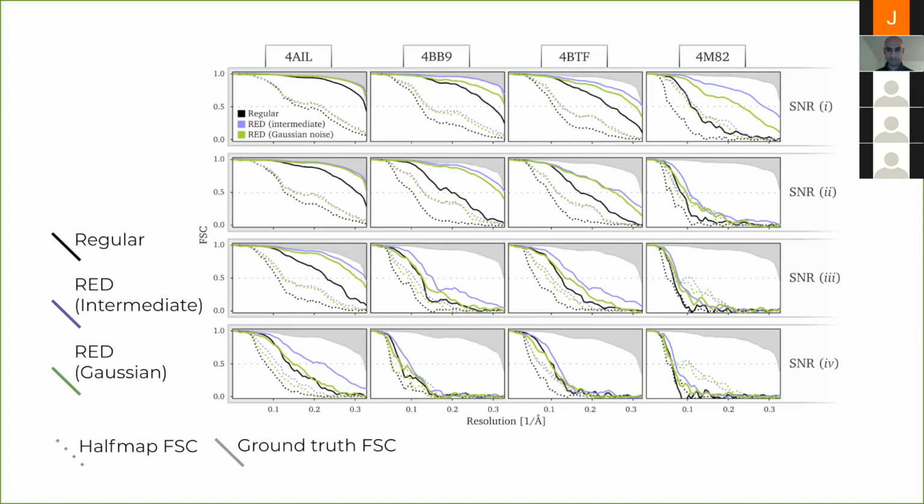I'm wondering if using something along the lines of the density histograms or the connectivity, translating those to the EM density, is something that has been investigated in EM and you folks decided it was better to just go with a neural network? Or, can you comment on why you go with one approach versus the other? Please let me know if that question made no sense and I should clarify.